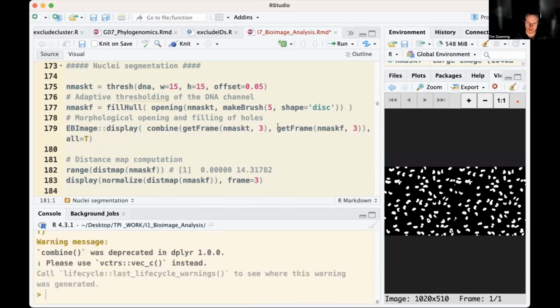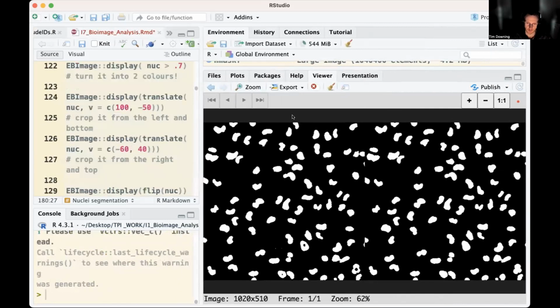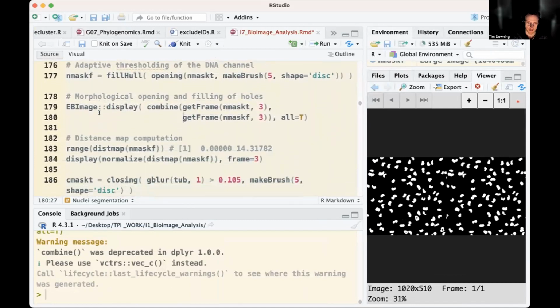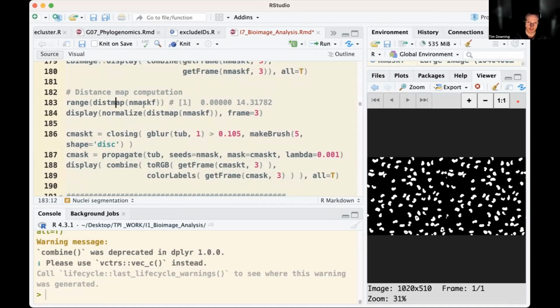So there we can see the two panels, and you can assess yourselves if there are any differences, or if it's worth writing code to detect any differences. But certainly you can see certain holes on our left that are absent on our right. So that's segmentation.